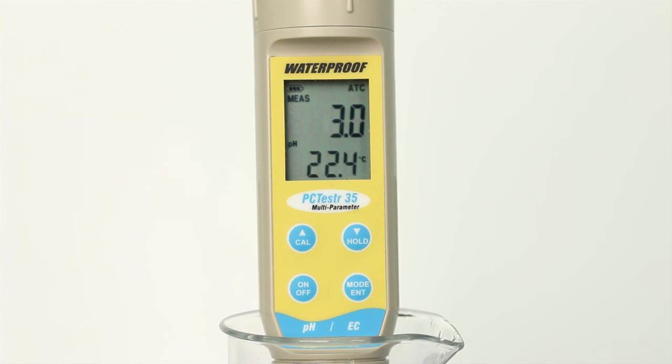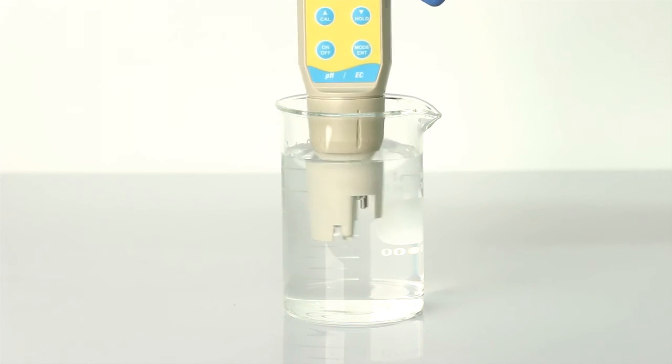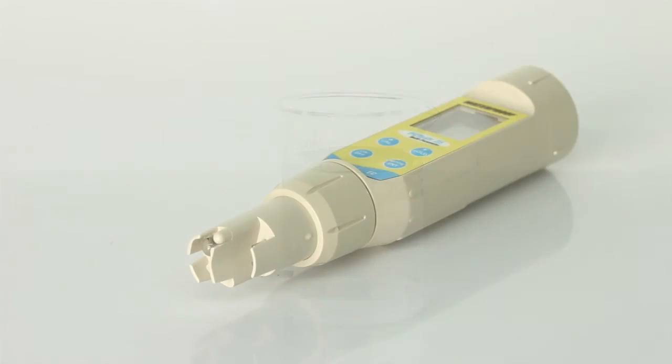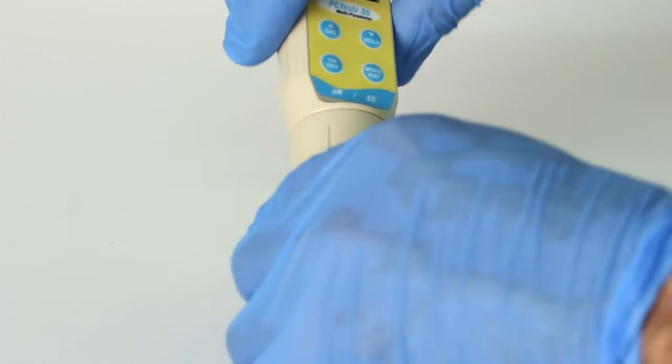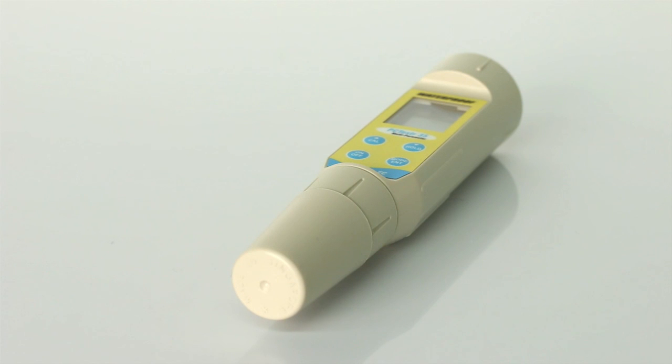The sensor does not require special storage. Rinse with clean water after use and cover the sensor with the included cap. Keep it at room temperature away from extreme temperatures. The sensor can easily be rehydrated by soaking if stored dry.